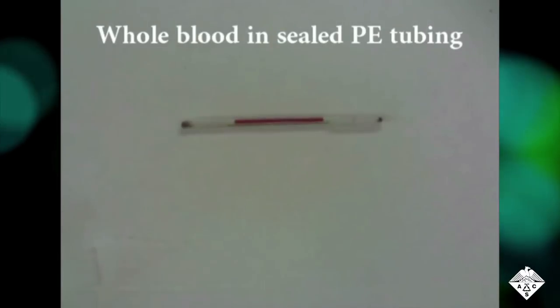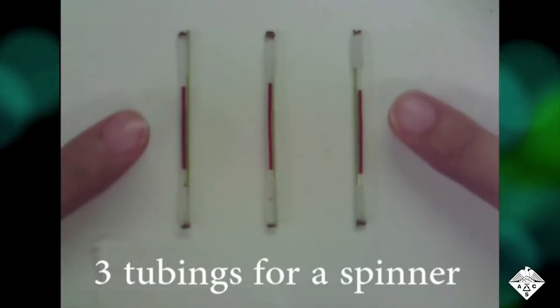To find out, the researchers placed human blood samples in tiny tubes, sealed the ends, and taped a tube to each of the three prongs of a fidget spinner.